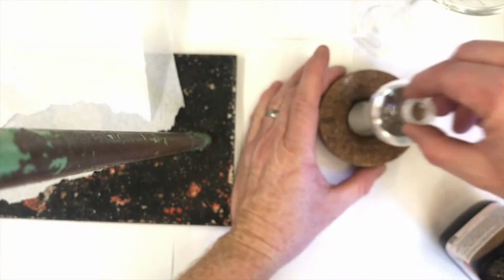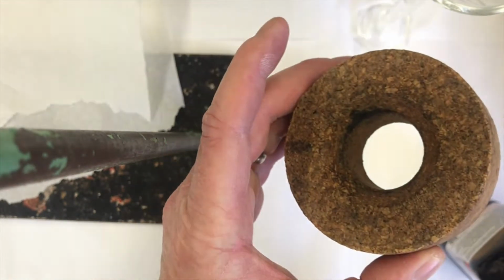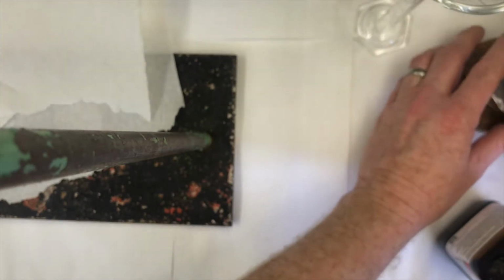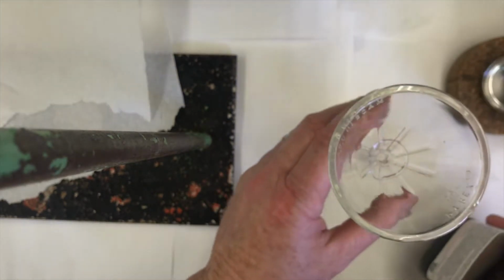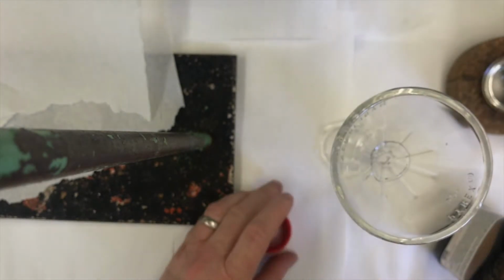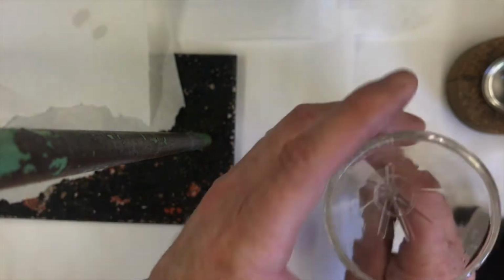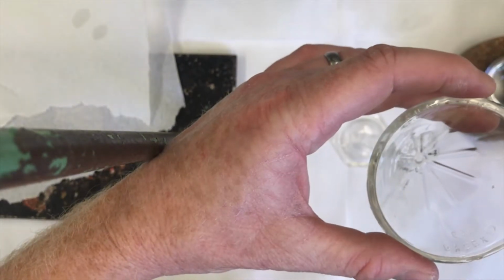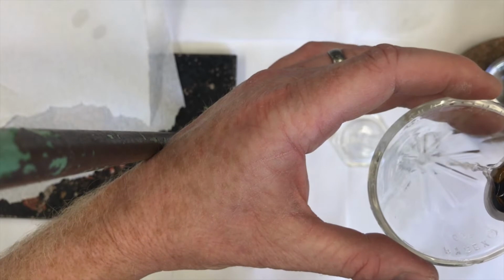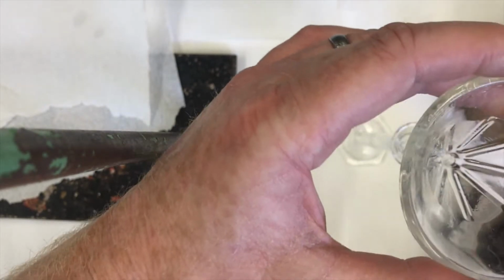Oh, you notice I'm holding my round bottom with this cork round bottom holder. It's how it's indented. It's a nice, easy way to hold a round bottom. Okay, now the bromobenzene smells very aromatic to me. Not a bad smell. It's strong.